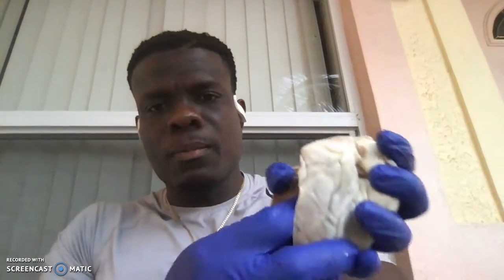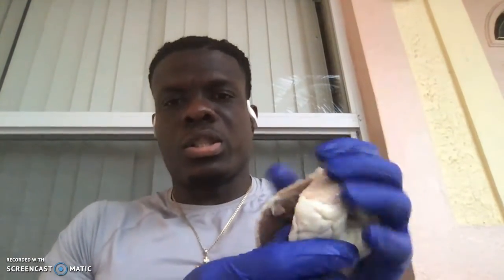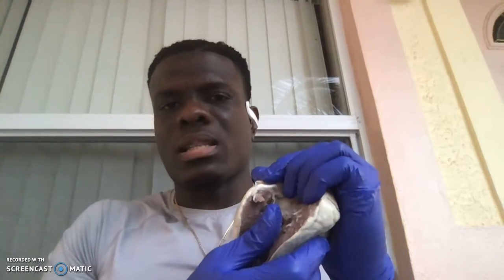So just to reiterate, this is my right hand. So you have, this is your left atrium, the left ventricle, the right atrium, the right ventricle. Your chordae tendineae is over here, and your interventricular septum is right in here as well. Like I said, some of the structures are really hard to see because it's kind of hard to angle this as I'm talking. But I'll try to explain as I'm going along with it.